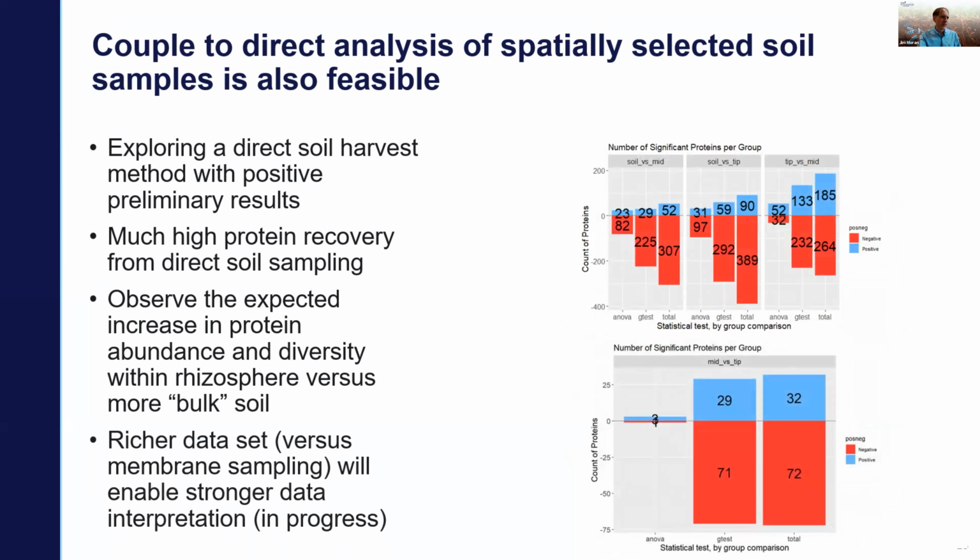And what I should also mention is that by getting deeper coverage of the proteomics, despite being a little bit destructive, we're still getting a deeper coverage, and I think that's going to really enable stronger science, enable us to address questions that we might not be able to address in other ways. The other really fascinating thing about this, we're still working out some of the final components of the method. One of the great things about it is that I think this can really be accessible for EMSL users.